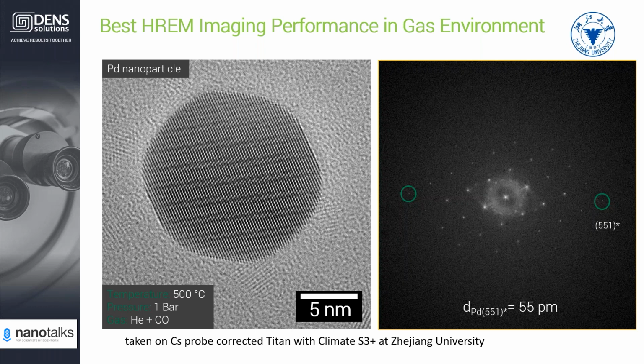And meanwhile, I don't want large segregations there. In this case, from my experience, you can get enough mass spectroscopy signal, and meanwhile, you guarantee as little sintering as possible happens in the process. So yes, this is truly a bit tricky. But if you want, we can share some pictures to see how to judge this criteria.